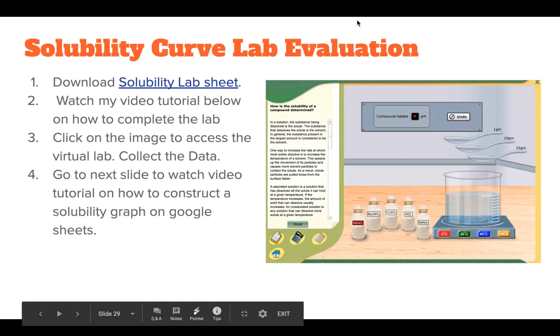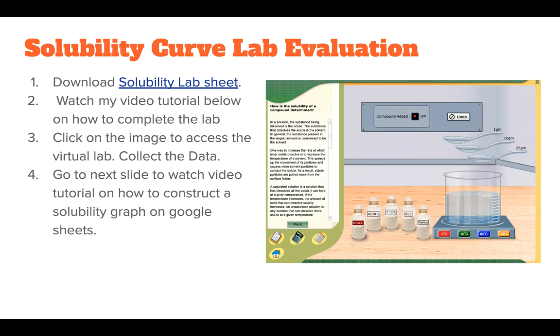Hi everyone, this is the solubility curve lab evaluation that we're going to be doing. It is a simulation. Before you get started, please download the lab sheet so that you can record your values or just have it open under a different tab.